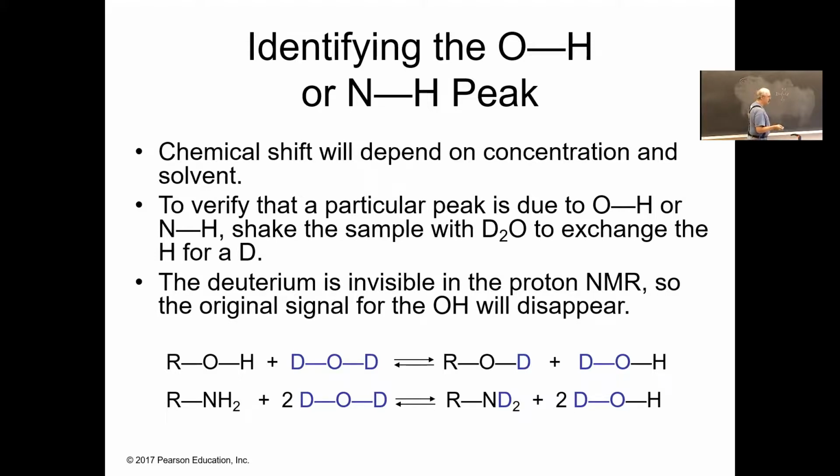If we used ordinary chloroform, this has a hydrogen, and that would absorb, and usually there's quite a bit more solvent than there is sample, and so we'd get a huge peak from that hydrogen, and that would just swamp out everything else.